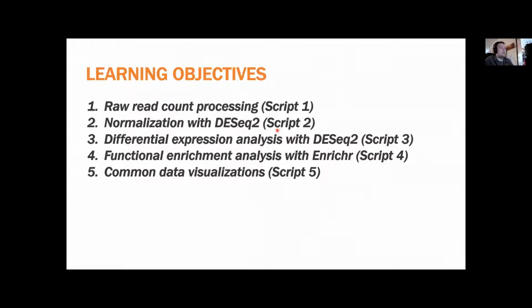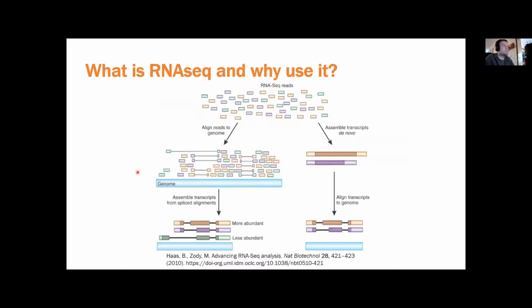Okay, so there's basically 5 different things we'll be going over, and they're all saved as different scripts. First being raw read count processing, normalization, differential expression analysis, functional enrichment, and some examples of data visualizations.